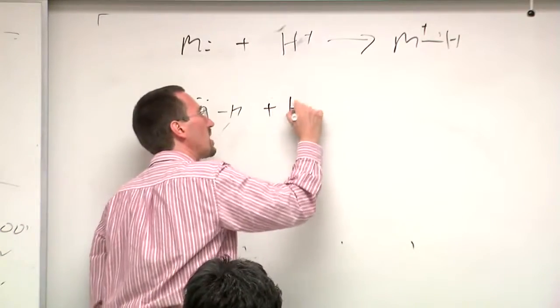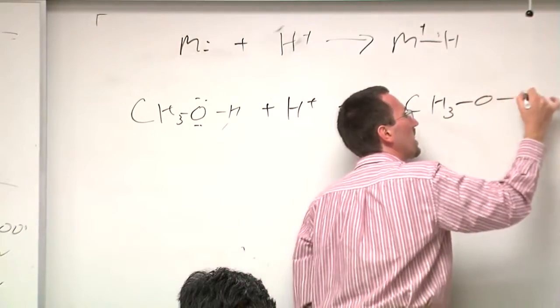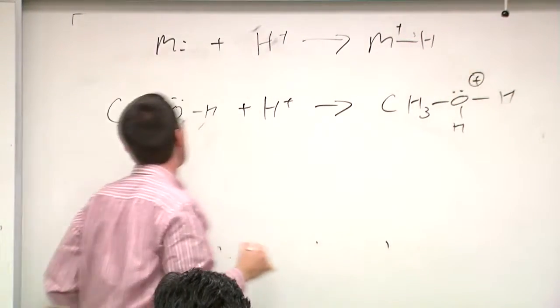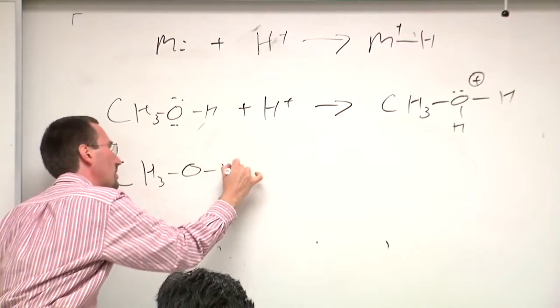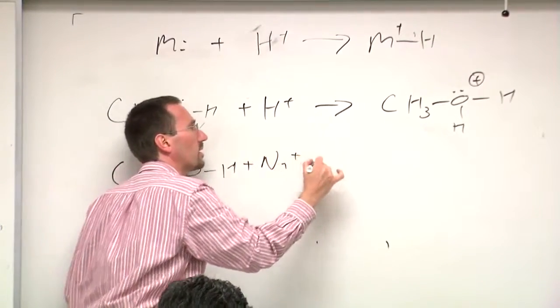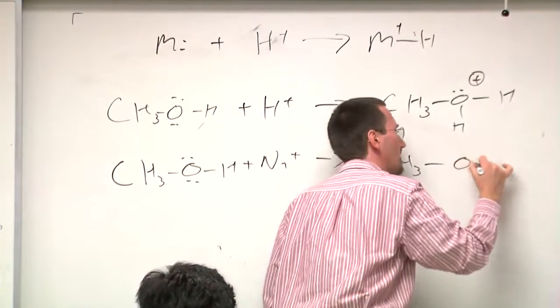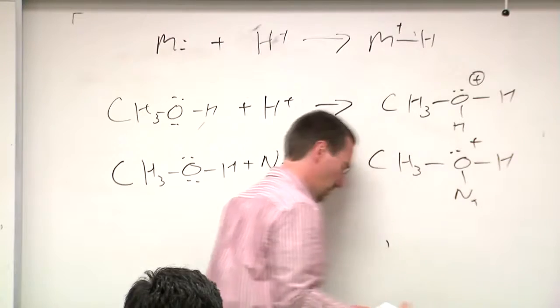If you put a proton on methanol, as I indicated before when I talked about diethyl ether, you will end up with protonated methanol. You have sodium from glass everywhere. So if you put a sodium on in your soft ionization, for example in an ESI mass spec, you'll end up with a sodium on your molecule.